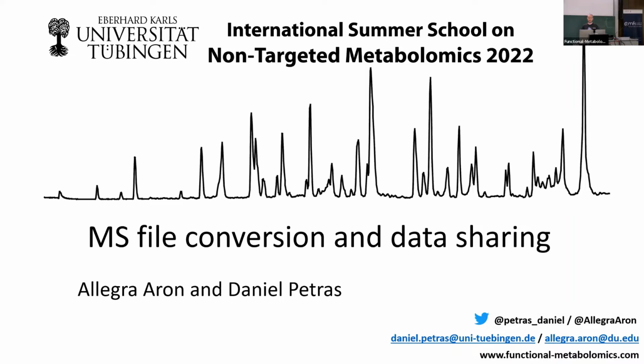And then we also want to dive into data sharing. Important for us, we first pull this data from a repository because it is already public, so that enables all of us to work with this data. But the data that we actually acquired yesterday is of course not accessible yet, so eventually we want to upload it and make it available to the community, to reviewers, to your collaborators and lab members, and so on. And Allegra is going to show you how to do that with the MassIVE repository.